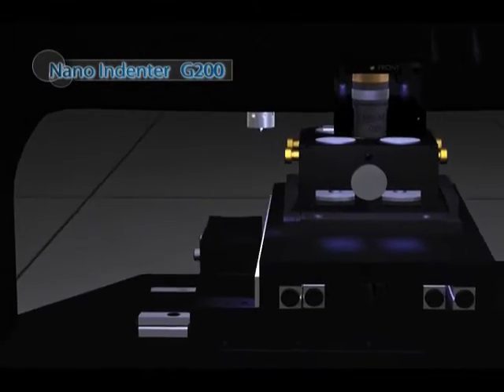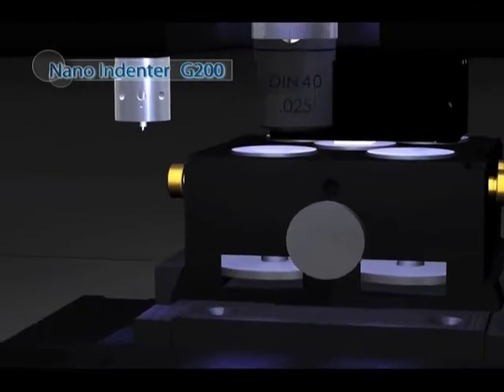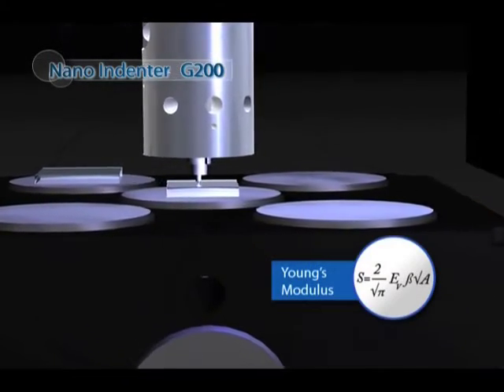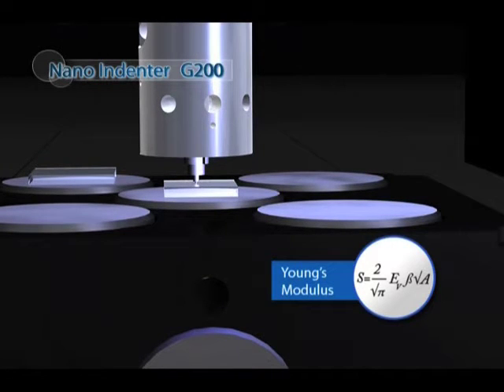During operation of the nano indenter, the samples are loaded into the sample tray and aligned to a common focal plane. Test locations on the samples are chosen under the microscope assembly. When the tests are initiated, the samples are automatically translated under the indenter where the probe engages the first sample.